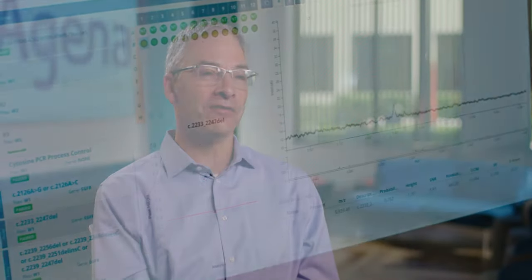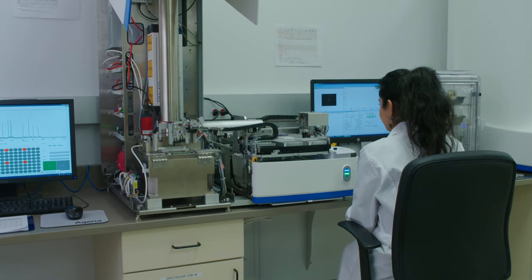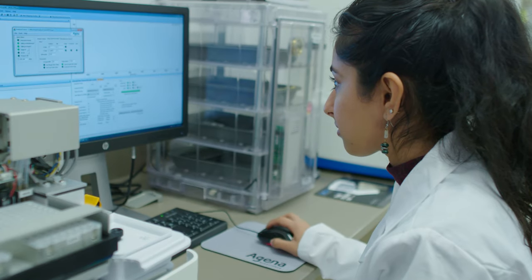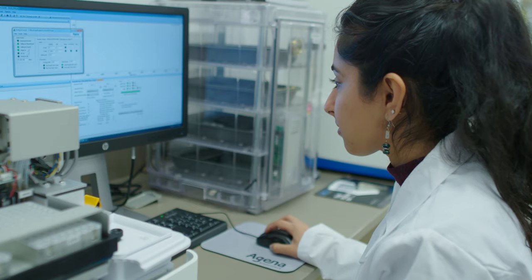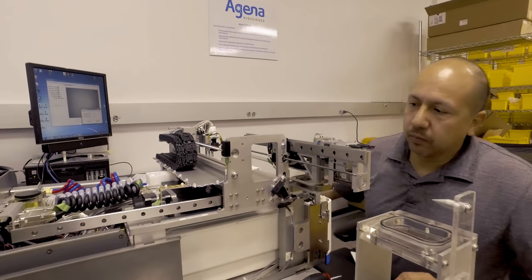Agena designs, develops, and manufactures our mass array system within our headquarters in San Diego, California. It helps us to assure the highest quality in our product and it enables effective teamwork amongst the development teams and the manufacturing teams to support our customers in the best way possible.